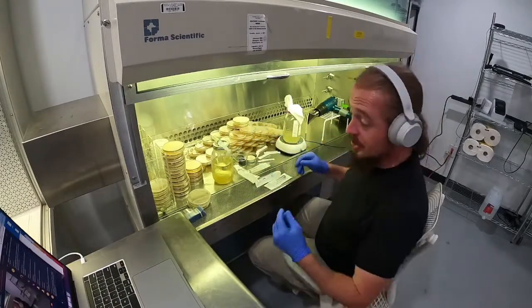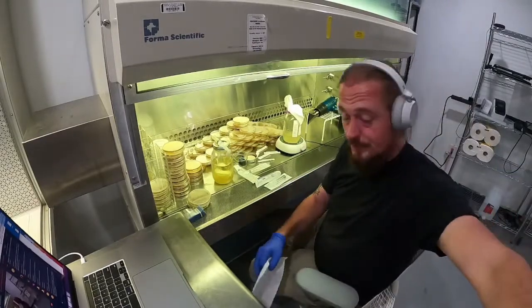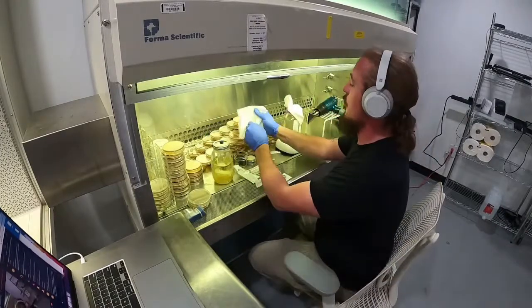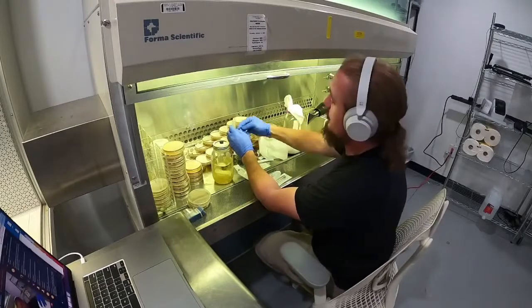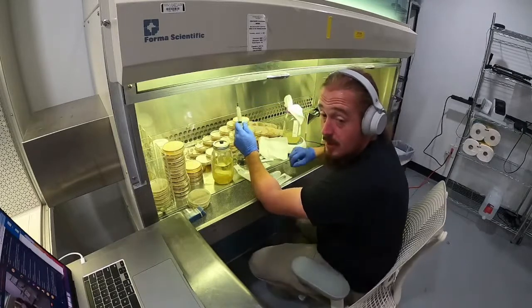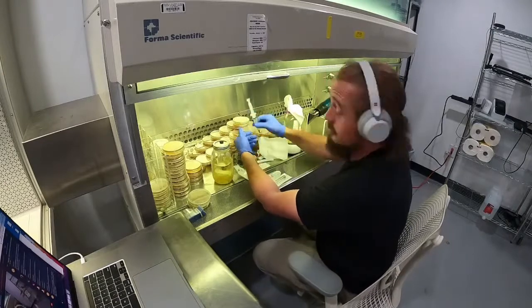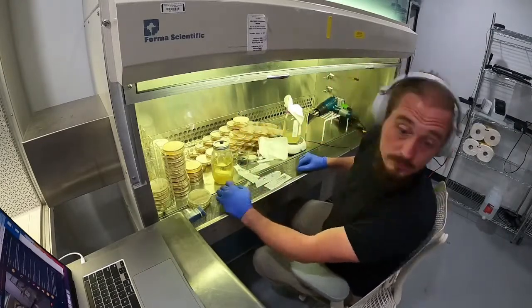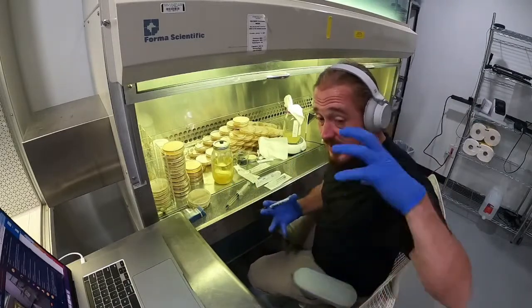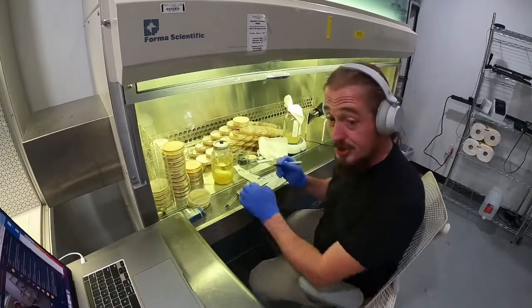So why would you use liquid culture? Easy. There's going to be virtually no lag time. The reason is that instead of having a lower amount of biomass to grow off of, you inject 10 cc's or more of liquid culture, which is pure living biomass. This liquid culture is going to start mycelating within the first 72 hours. Your agar plate will also mycelate really fast, but because there's less biomass, it will colonize more slowly. So liquid culture is all about speed.